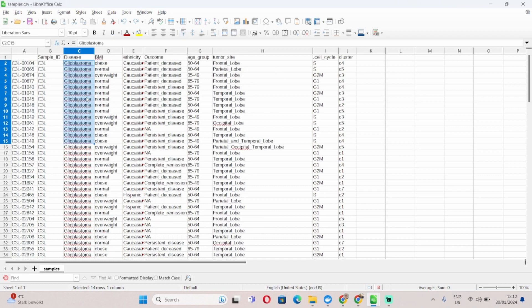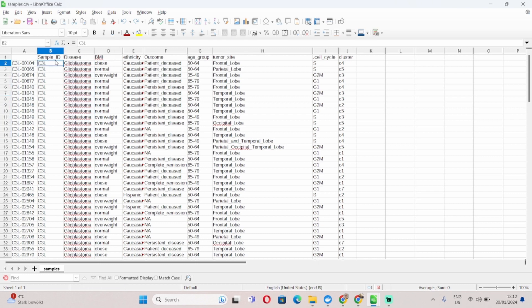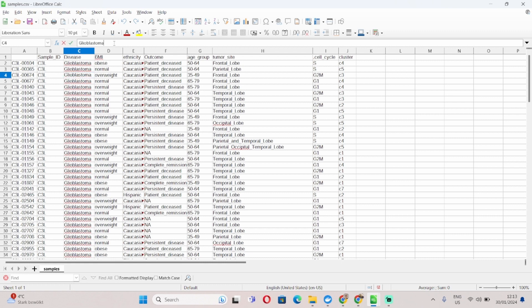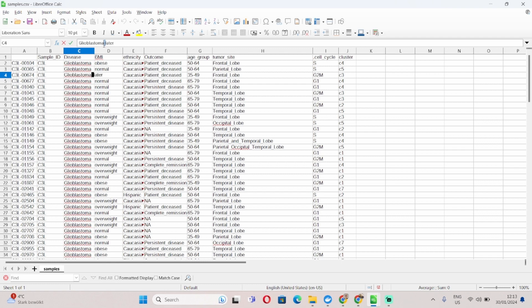It's very important again to remember not to use any special characters when you either name your phenotypes or when you label each of the individual samples. So don't do something like this or something like this because these are not accepted symbols. If you want to join names use underscores or hyphens are fine too.